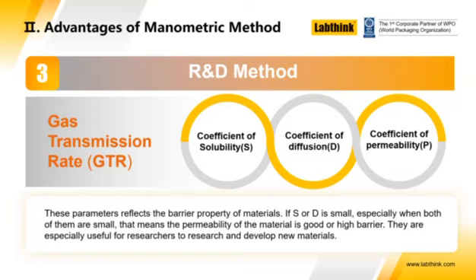In fact, if you study the standard D3985, the coulometric method, it goes on to explain that the material that was created in order to verify the coulometric OTR measurement method was available at the time from NIST, and that material was measured using the manometric method.